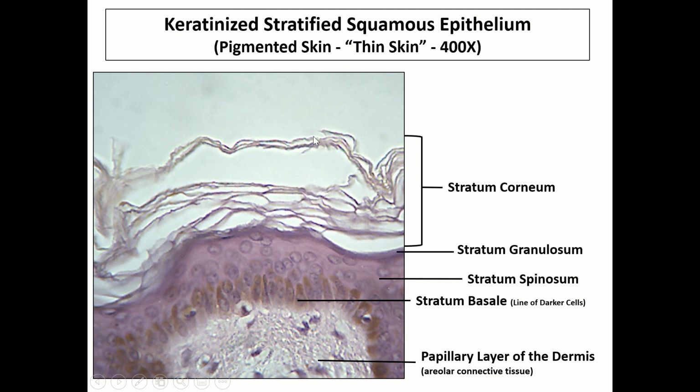Now, it's important here to stop and compare this with the non-keratinized epithelium. In the non-keratinized epithelium, in those most apical layers, you could still see nice cellular shapes with very clear and dark nuclei. However, through the keratinization process, as these cells in keratinized epithelium harden, they actually die. They extract their organelles, including the nucleus, and so they're not visible here in the uppermost layers. These layers that look the most fibrous and are the most hardened are known as the stratum corneum.